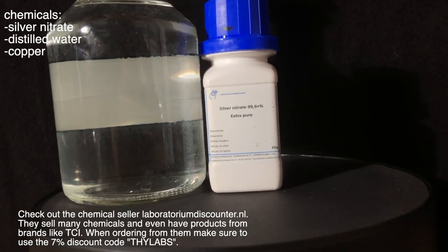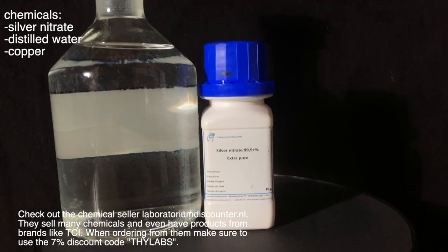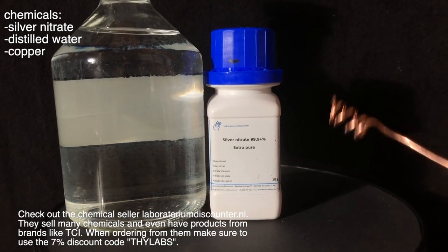Welcome everyone, today we are going to make a silver tree. For this you are going to need silver nitrate, distilled water and a coil of copper.